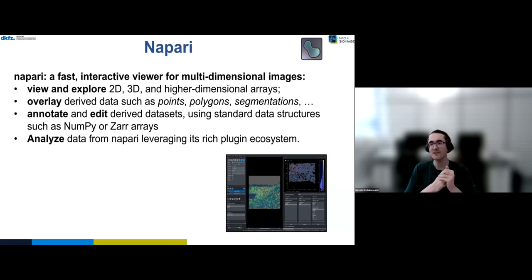And what I think is especially nice for the spatial data side of things is to perform annotations on the images, and also on the cells and the table. And then these annotations can also be saved and kept back in our SpatialData object.